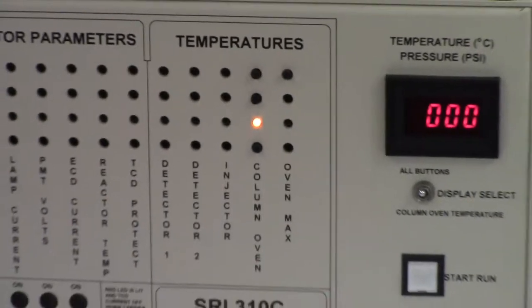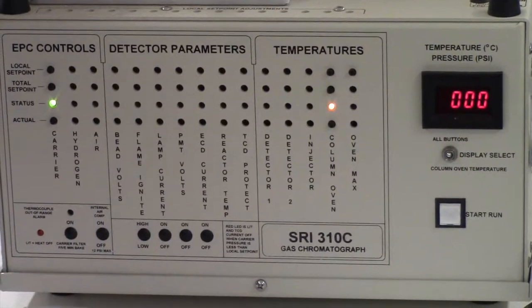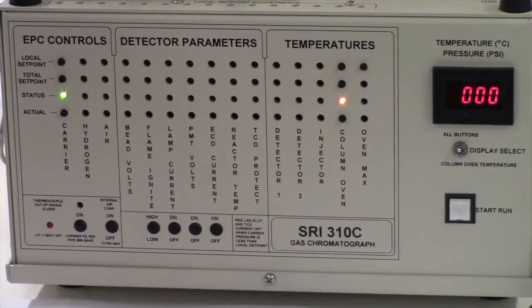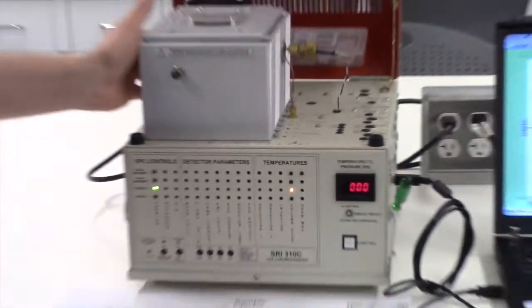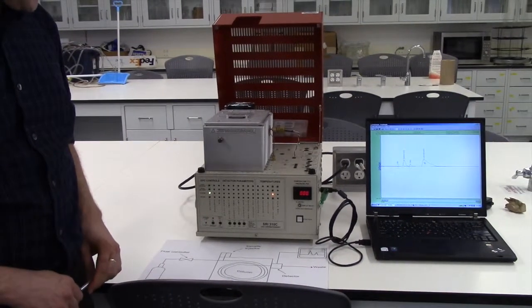For this particular model, it's not recommended to go beyond 180 to 190 centigrade. It's not a professional machine, so some care should be taken.